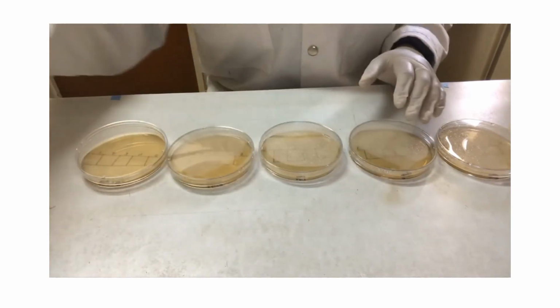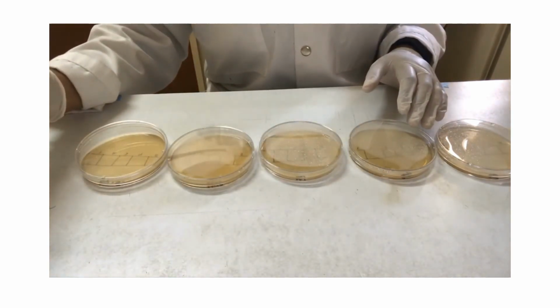Notice how she heats and then cools her loop, therefore sterilizing it before she moves on.